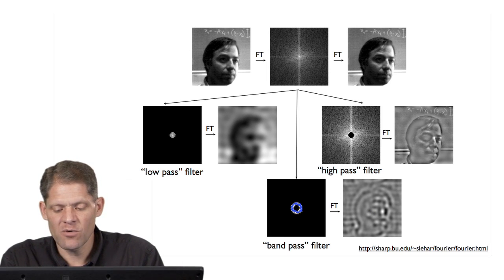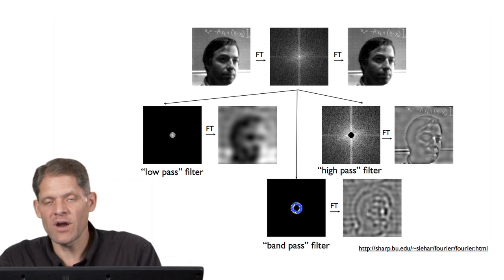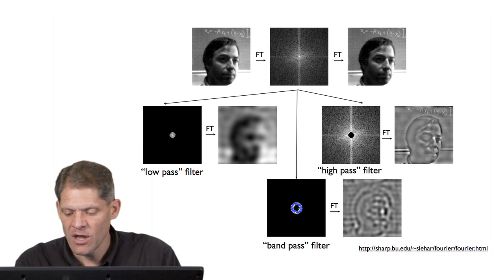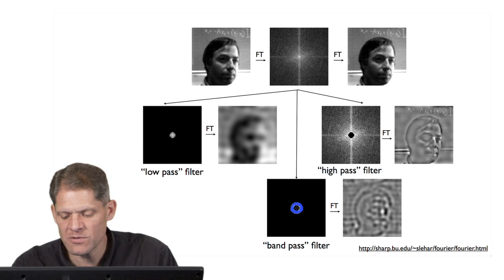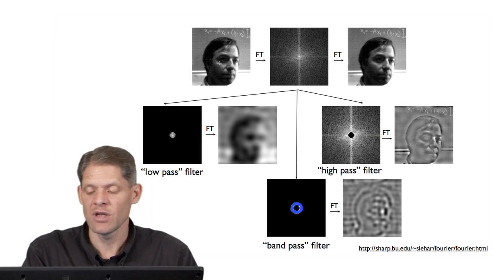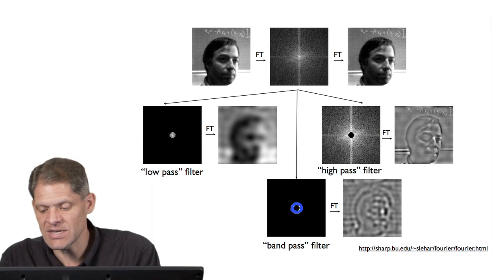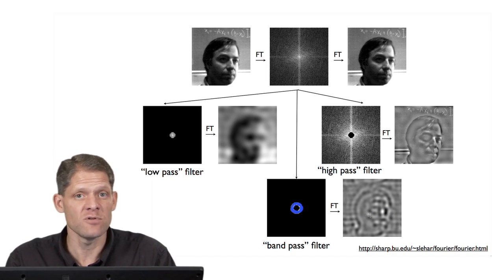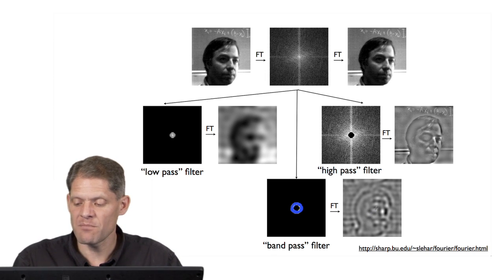So here we're adding together very many two-dimensional sine waves with their relative amplitudes and phases, but we're only using the sine waves represented by this band of reciprocal space, and all the others have been zeroed out, both at lower frequency and higher frequency. Then we get an image that resembles the original image, but it lacks both the low frequency details and the high frequency details. Some of the features are absolutely real and appropriate, but other details are missing.